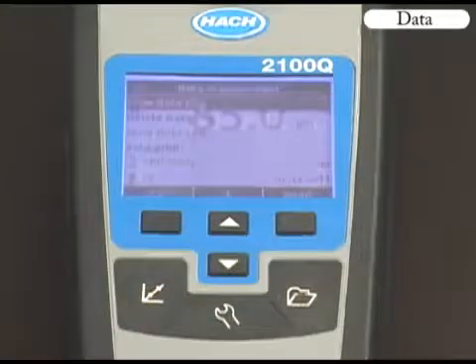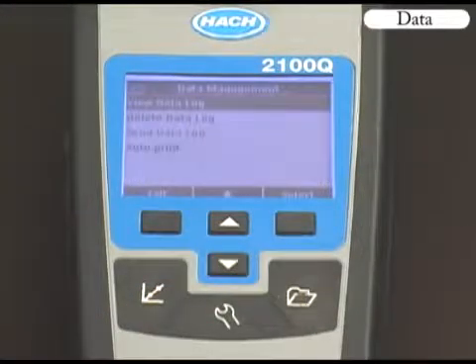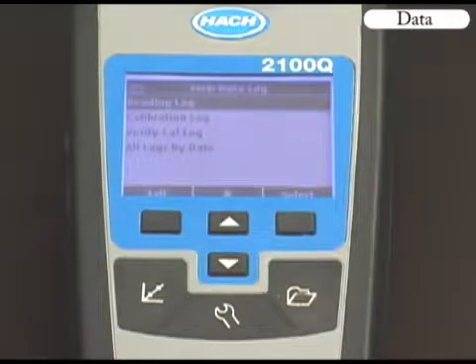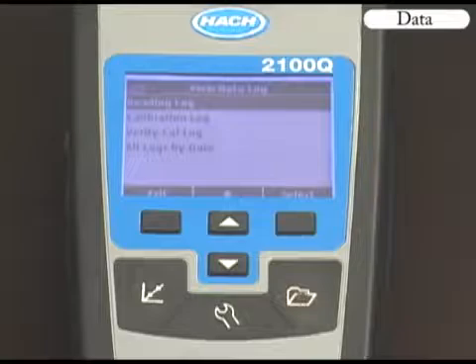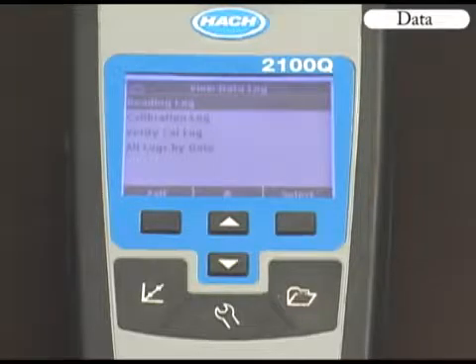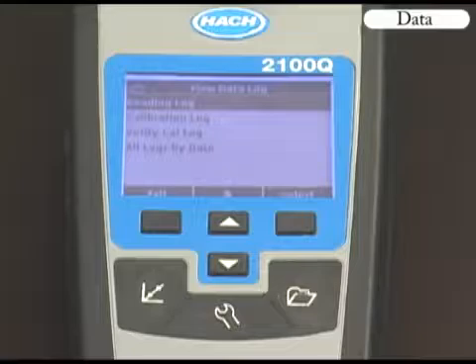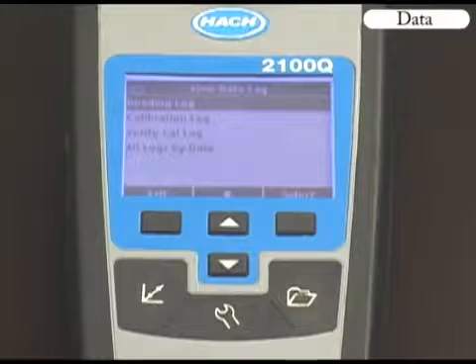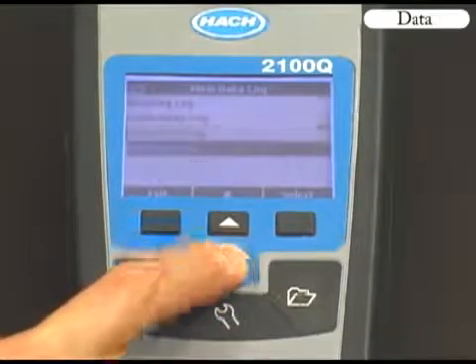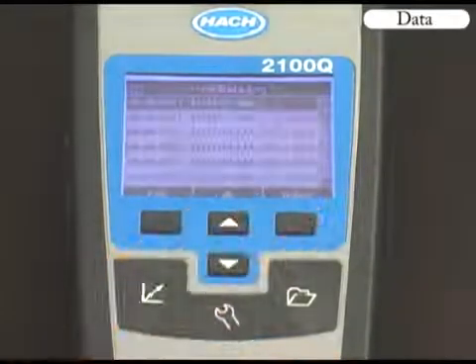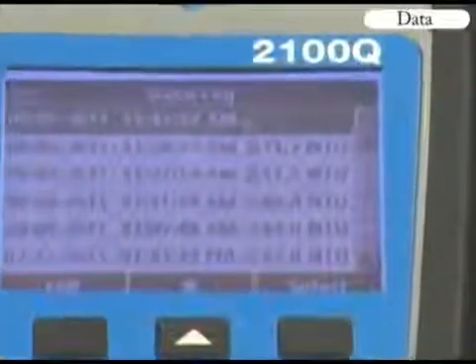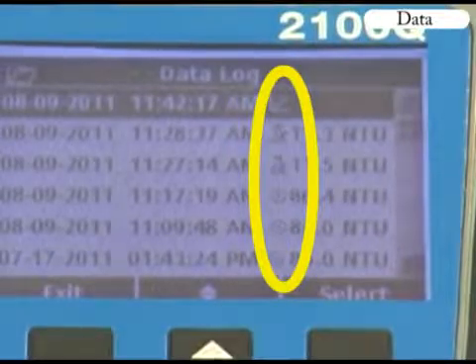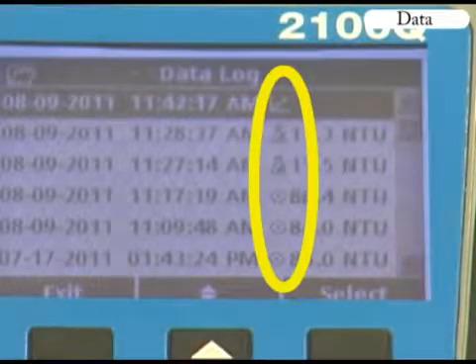To view stored data, press the Data Management key and select View Data Log. If you select the reading log, you'll view all sample data listed by date. If you select the Calibration or Verify Cal log, calibration or verification data will be listed by date. If you select All Logs by date, an icon will appear to show whether the stored data is from a normal reading, calibration, verification, or rapidly settling turbidity reading.